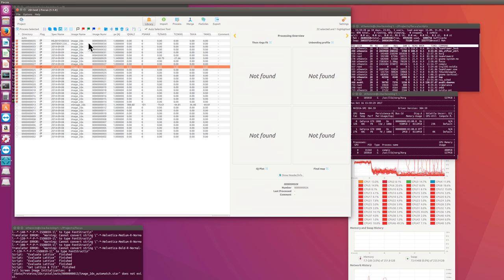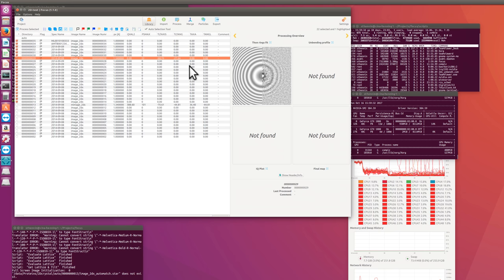So this works at the moment on image 29. First tilt axis and tilt angle is already known. But the other values not yet, but should come in soon. Pixel size was already corrected.